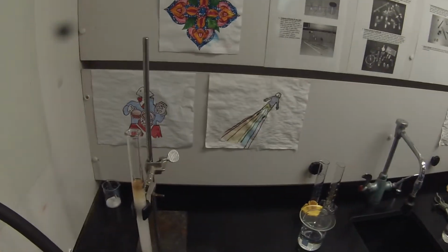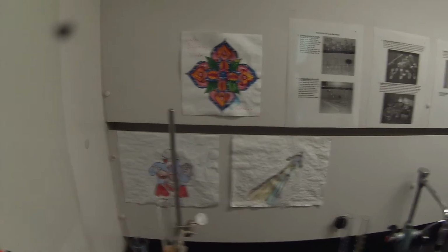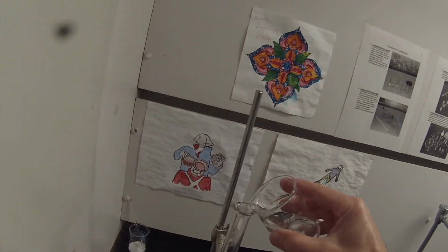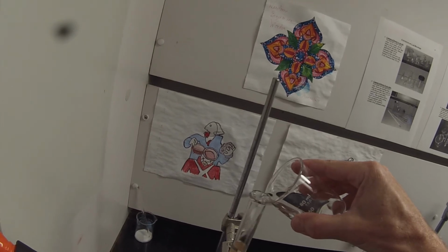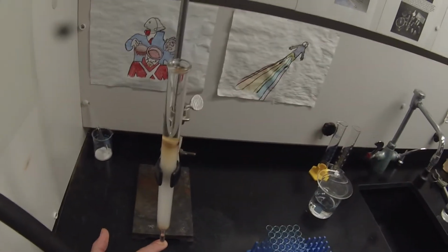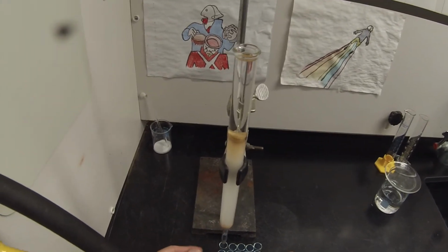And I'm going to use some air pressure to try to get rid of the crack. You don't want much. You want to be able to feel it when you release it, kind of hear it, but only once you release it. So now I'm going to fill that up carefully so as not to disturb the top too much with petroleum ether. And I'm going to start that dripping into my first tube.